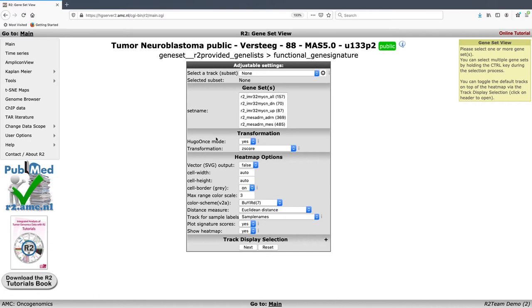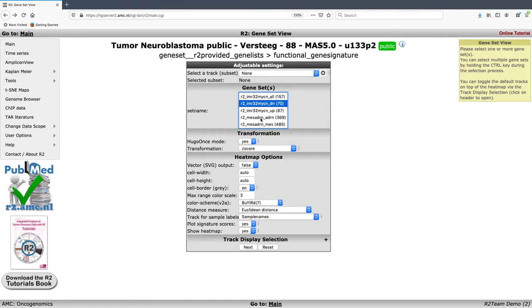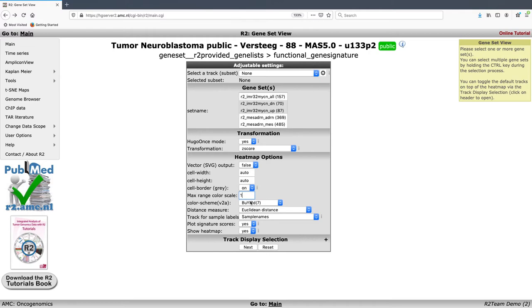We are presented with a list of available signatures. The gene set with 157 genes is the one we looked at in the k-means analysis — all genes either up or down regulated in the MYCN experiment in IMR32. Below it, from the same experiment, are two subsets labeled DN (down regulated) and UP (up regulated). We are going to select both of these by holding shift or control, set the color scale range to one to intensify the differences, and click next.